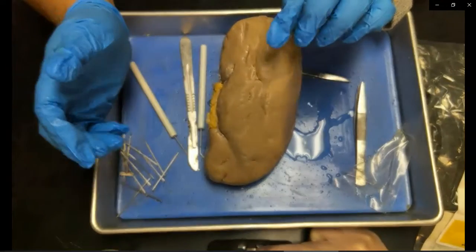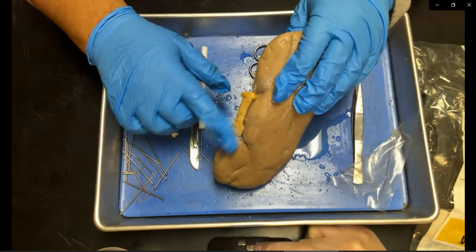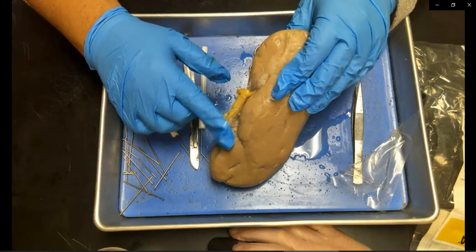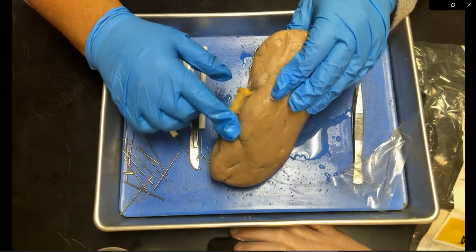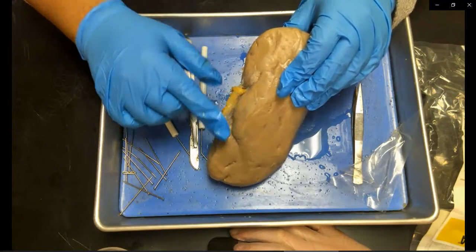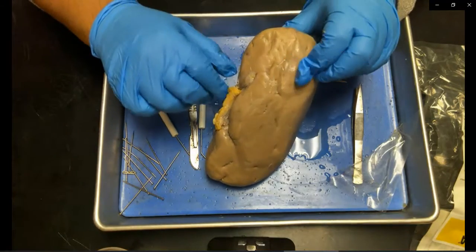All right, so this part right here that is yellow, that is actually going to cover the ureter. So underneath all of this yellow part, this is fat, it's going to protect that ureter. And remember, those ureters are going to drain out the kidney and lead that urine to the bladder.